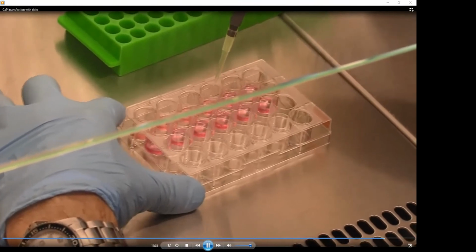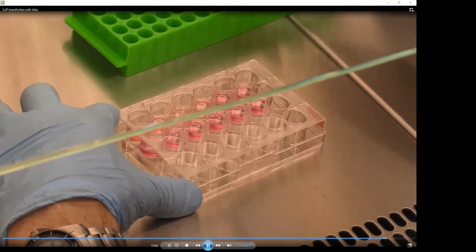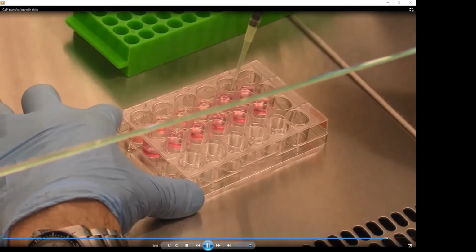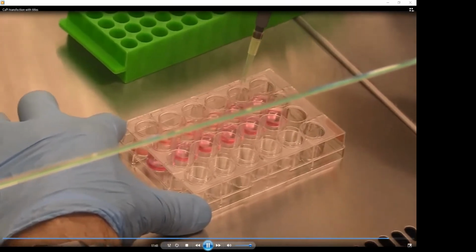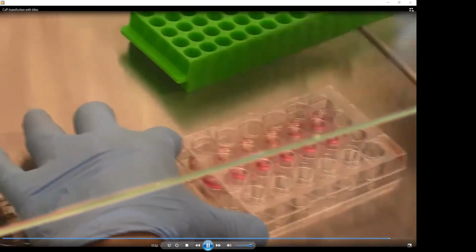So step by step, this was added to all samples, B1, B2, B3. Always mixed in between.